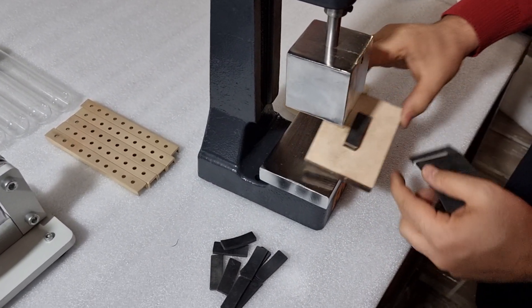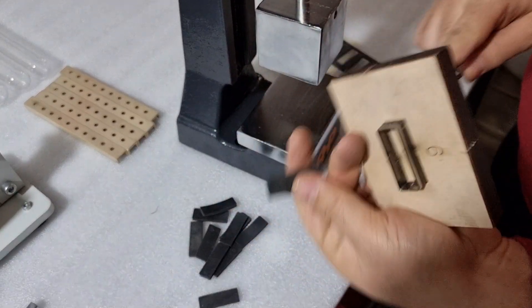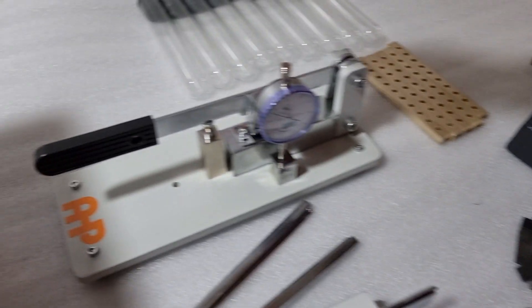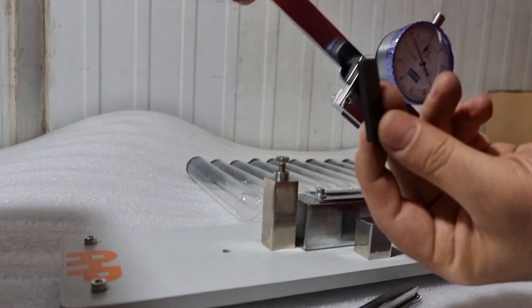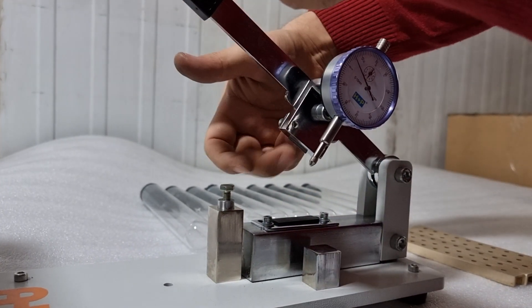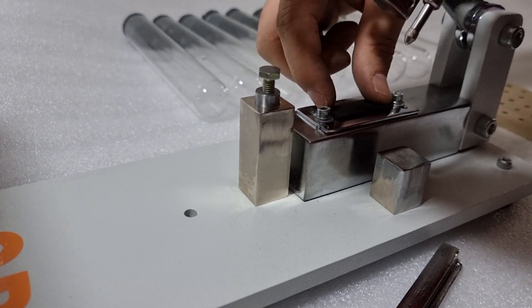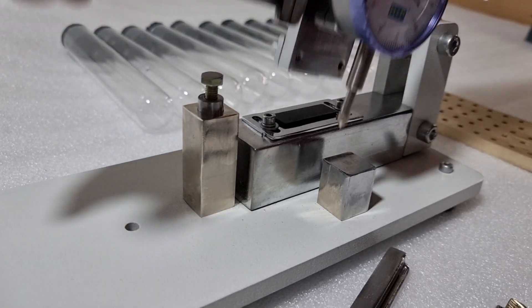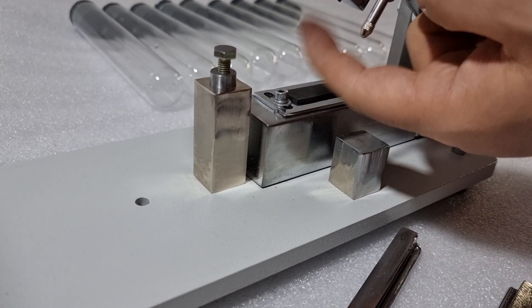You will cut the samples very quickly and very easily. I just prepared 10 pieces of sample pieces. Then we need to make the notches. There is a place to put the sample piece here, and also two screws to adjust the cutter right in the middle of the sample piece in the lengthwise direction.